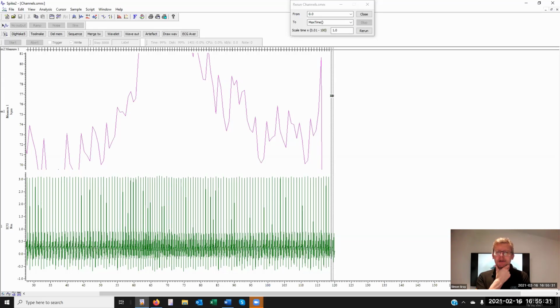He'd spent a long time moving cursors, cursors in non-active mode in 5-second chunks, taking measurements and logging it to a text file.